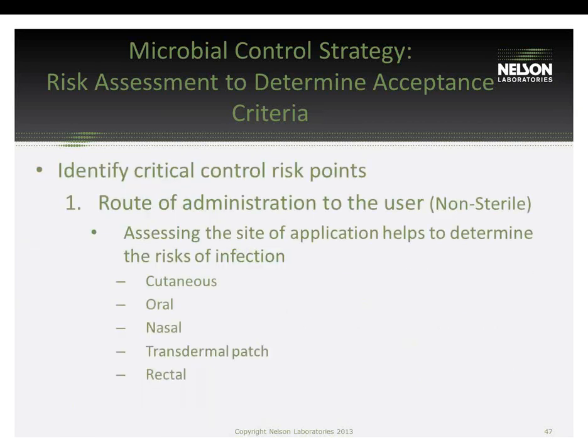So for route of administration, which we've discussed in USP 1111, note that the site of application helps determine the risk of infection. Products used on the skin, oral, nasal, and transdermal patches are going to have far different risks than a rectal use product.